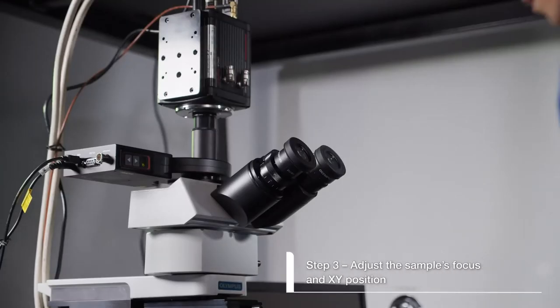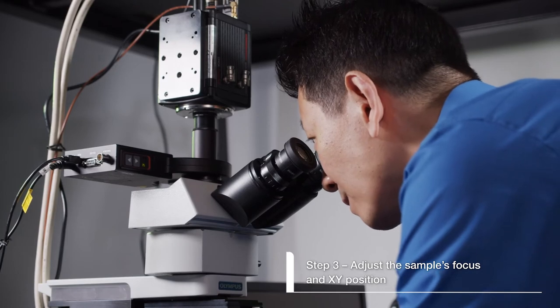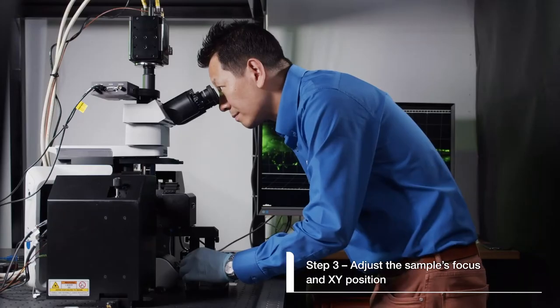Step 3. Adjust the sample's focus and XY position by using transmitted light through the eyepiece.